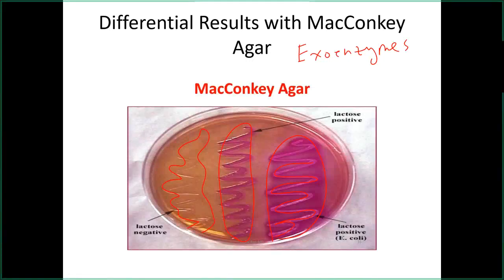So there's MacConkey agar, and I can't really tell you why the two different agars are out there. They're both commonly used. I don't know if there's some people that prefer EMB for, say, testing environmental samples, and MacConkey is used for testing body fluids and that sort of thing. I'm not sure. They both give similar results, and it may just come down to personal preference.